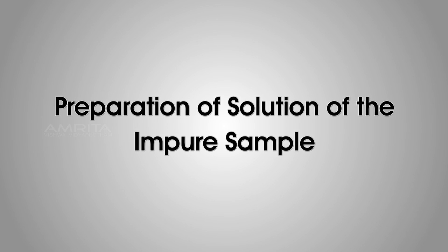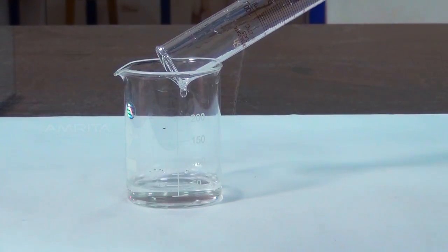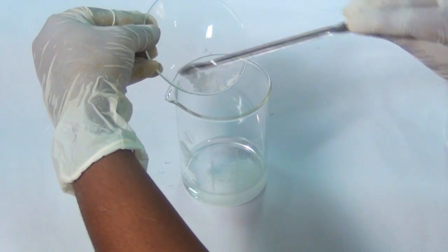Procedure: Preparation of solution of the impure sample. Take about 30 ml of distilled water in a beaker. To this, add about 6 g of the crude sample of Potash Alum using the spatula.